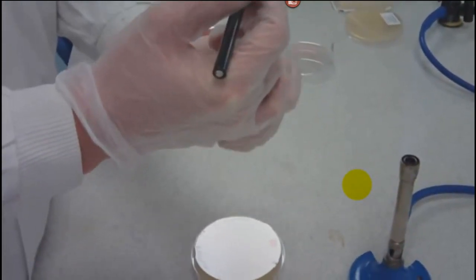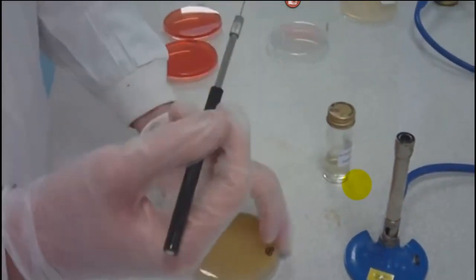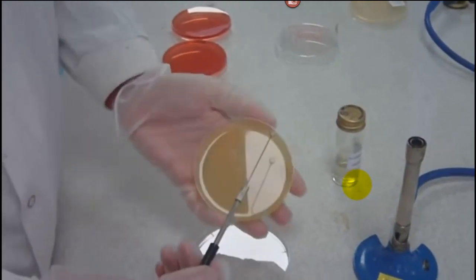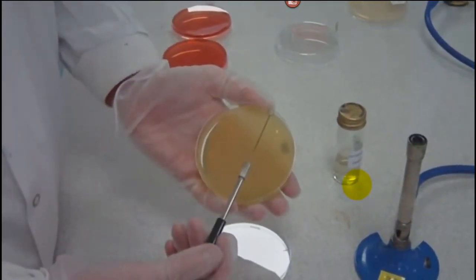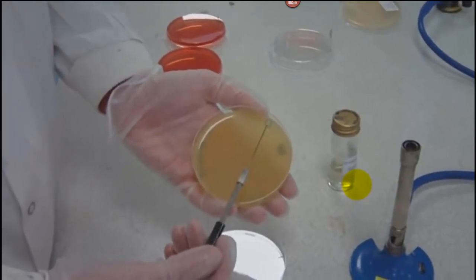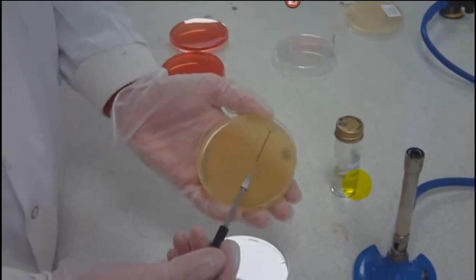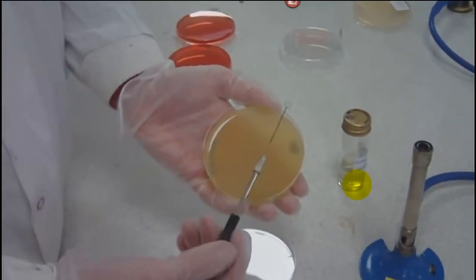And the reason I'm showing you this is when you streak a plate, and that's what part of this diagnostic media is for. So look, he's taking his loop and he's still explaining. But now he's going to touch the loop to the agar, and it looks like he's making a small, okay, just a small spot.